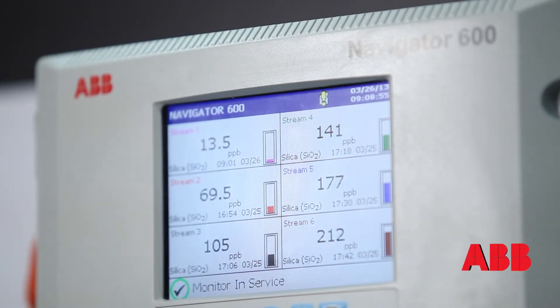The flow rate through the unit itself is designed to maximize the reagent over the course of a three-month span. So we're not replacing reagents every month or every couple of weeks — we have a three-month span of use.